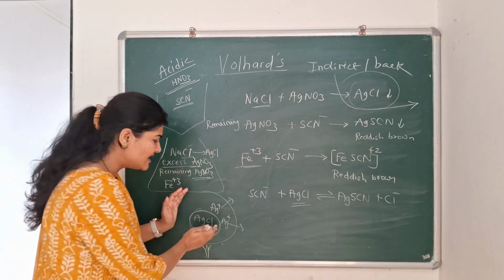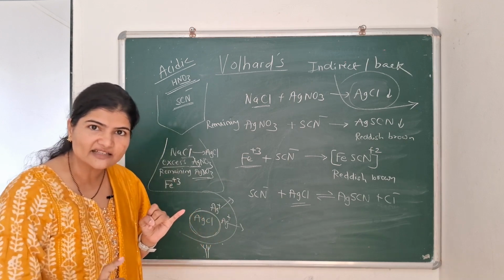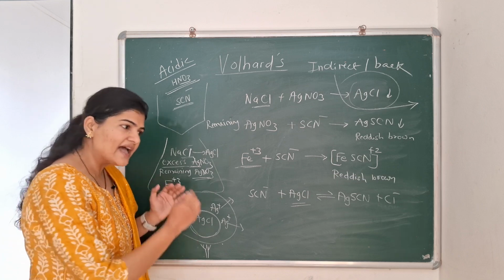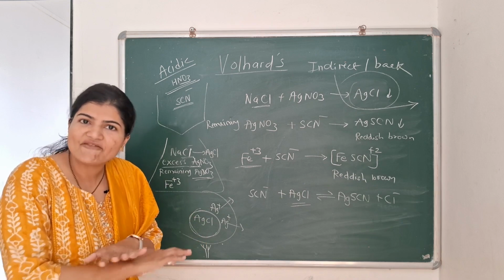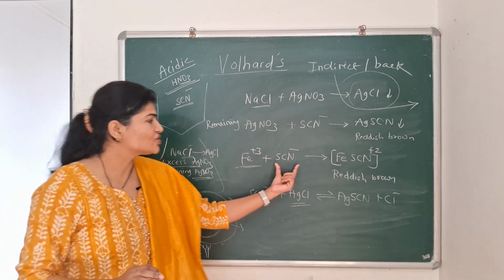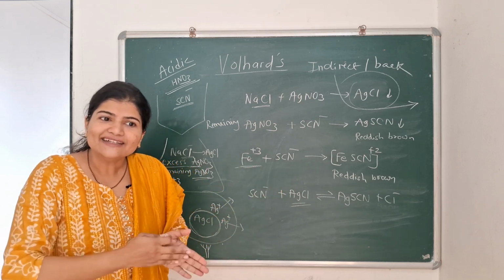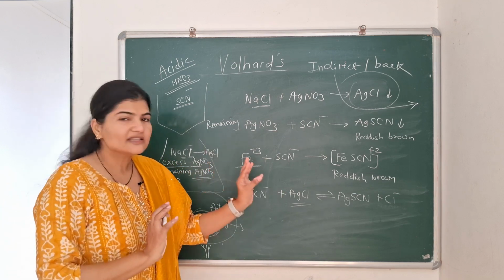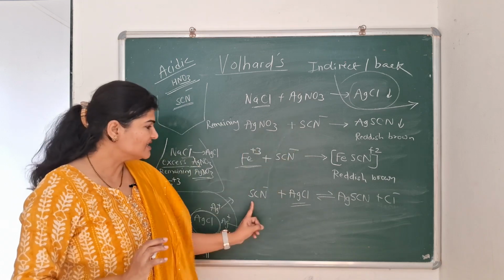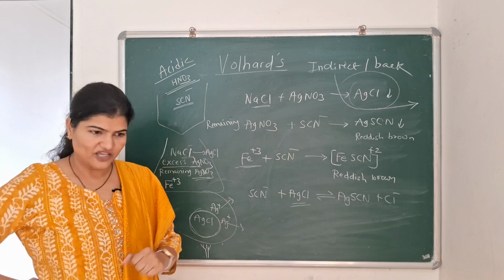So now the AgCl PPT, in the first place, does not adsorb any silver ions, and secondly, as it is in combination with the coagulant, it is not available for the reaction with thiocyanate ions. So once it is formed, it gets engaged with the coagulant, and hence it is protected from this unwanted side reaction. So this is another way.